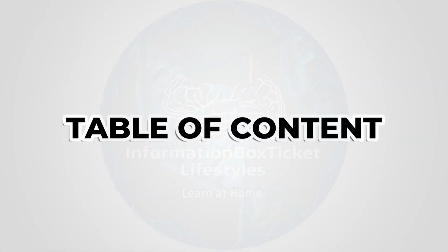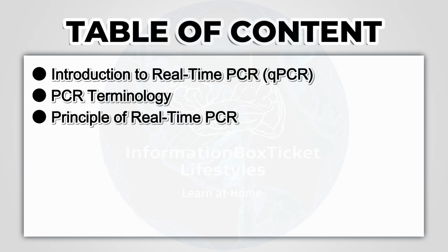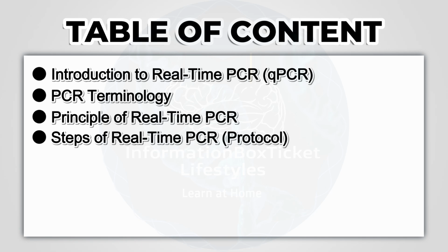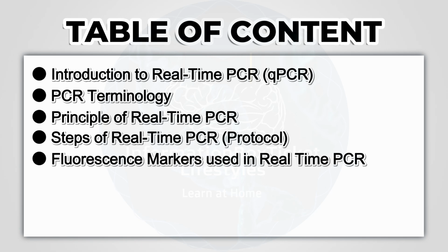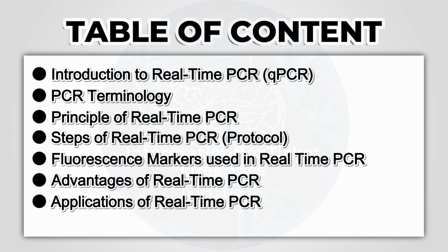Table of contents. Introduction to Real-Time PCR, qPCR. PCR Terminology. Principle of Real-Time PCR. Steps of Real-Time PCR. Protocol. Fluorescence markers used in Real-Time PCR. Advantages of Real-Time PCR. Applications of Real-Time PCR.